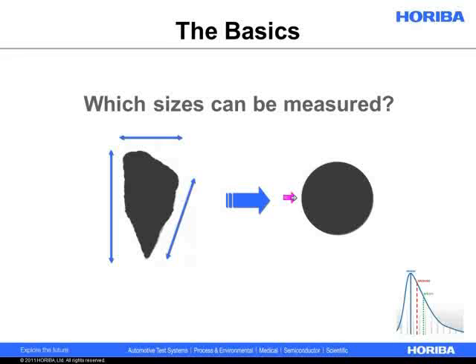It's really only easy to solve when it's a simple case like a sphere or a circle. So you'll see a lot of techniques, especially light scattering techniques, make this assumption that whatever particles are in your sample are actually spheres. And there's going to be some error built into that assumption, but a lot of times it's error that we can live with because it still shows changes in product performance or process performance.